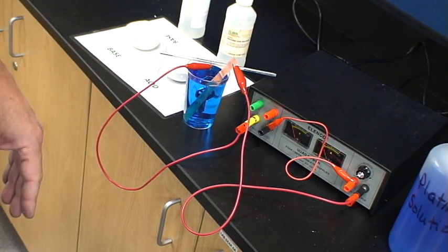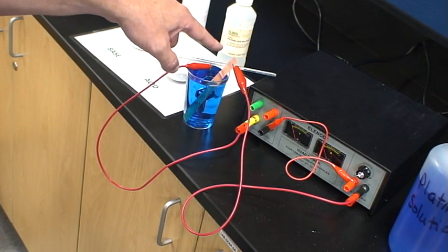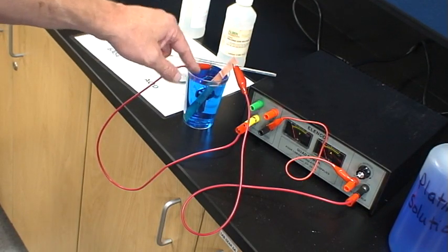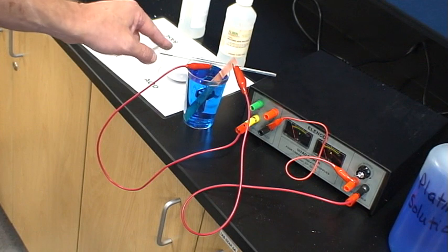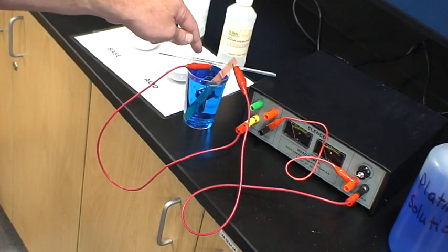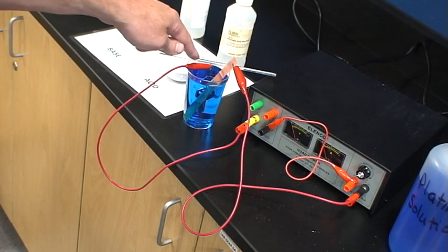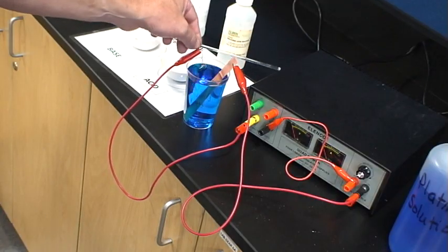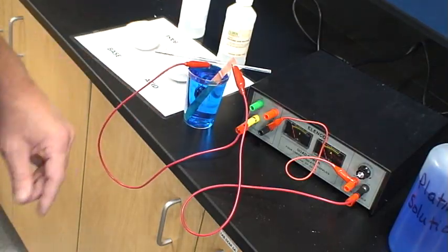Now let's think about what's going on here. The copper sheet is going to be oxidized at the anode. I'm going to force it to lose some electrons, and that will release the copper ions into solution, and we're going to be putting the reduction at the cathode. So the copper ions are going to reduce right on this end, and that's going to plate the copper. It's going to reduce the ions into copper metal, and that'll plate right onto the key itself. Remember, we have the metal key sitting in solution, and basically I'm just waiting to turn on the power source to start to force those electrons to go.